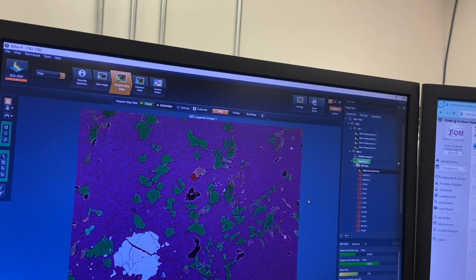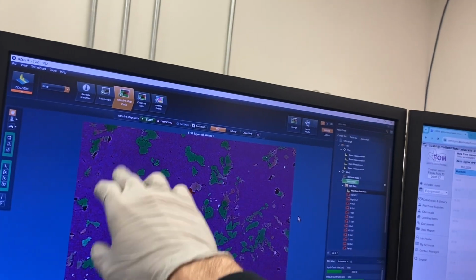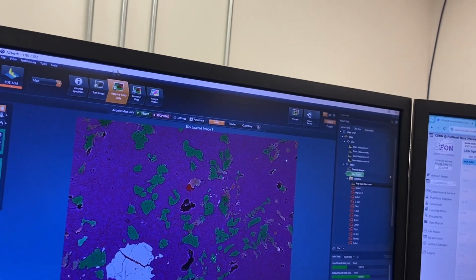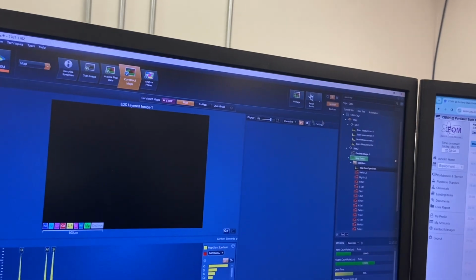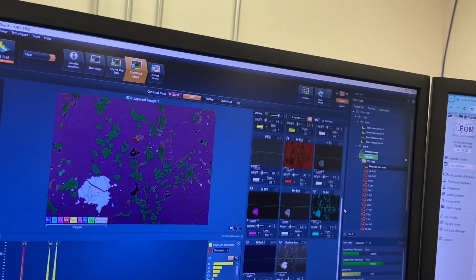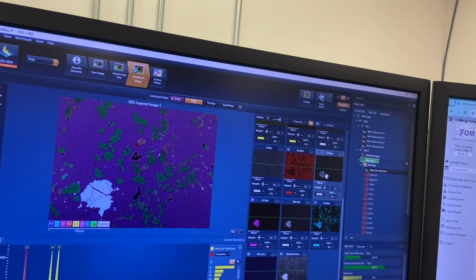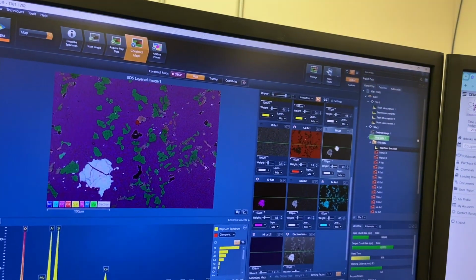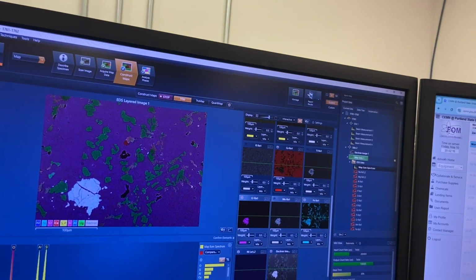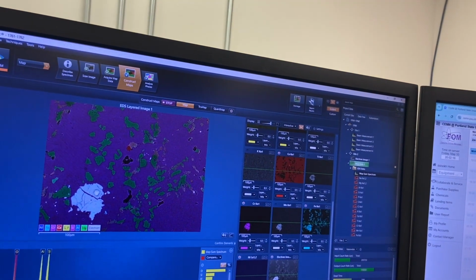So really here, I don't know. I think I need to get compositions of these olivines. I need to check in the feldspar here. I want to see what this is. I think it's chromite. Let me see. So I can actually look at the individual elements here. So yeah, chromium, iron, chromite. Chromite also has titanium. We can see it's zoned. It has a depleted core. It goes to the rims. That does reflect the fact that the melt probably became more titanium rich during the time you crystallized this.